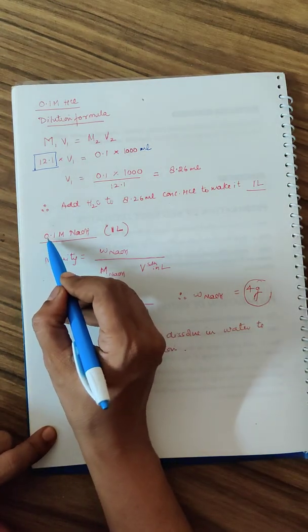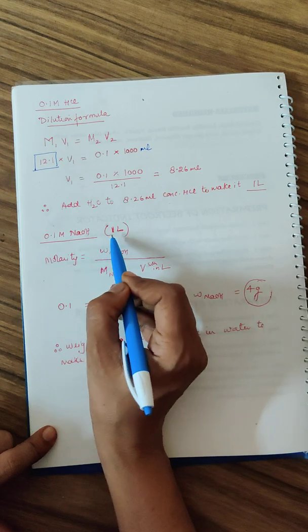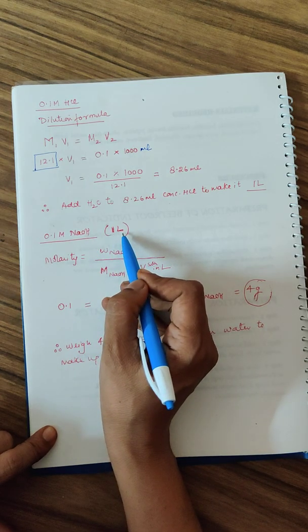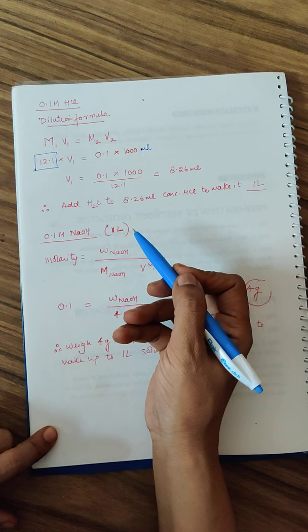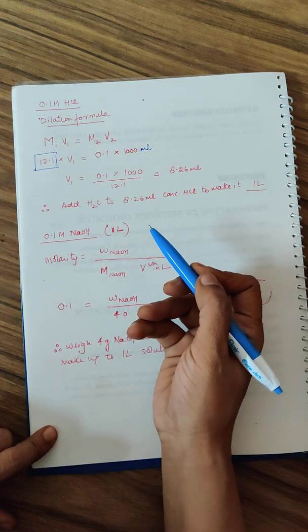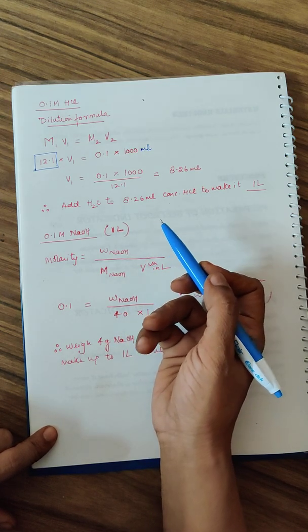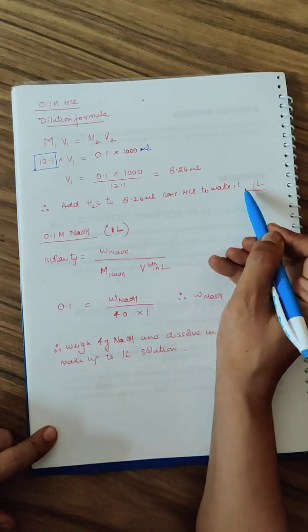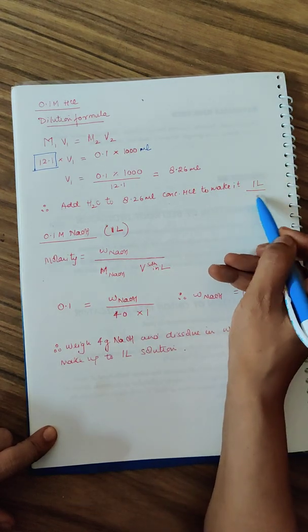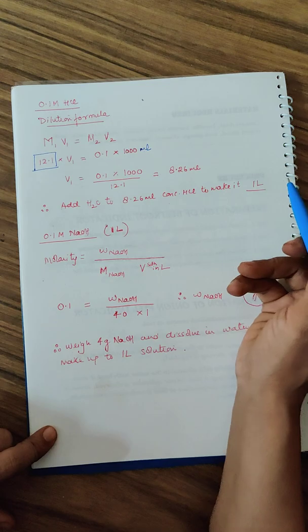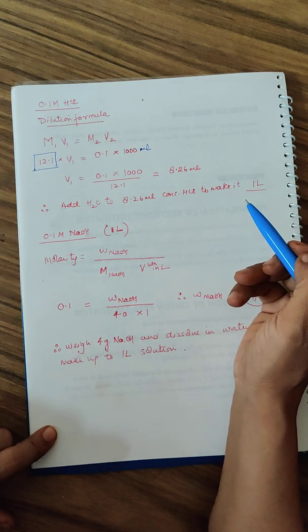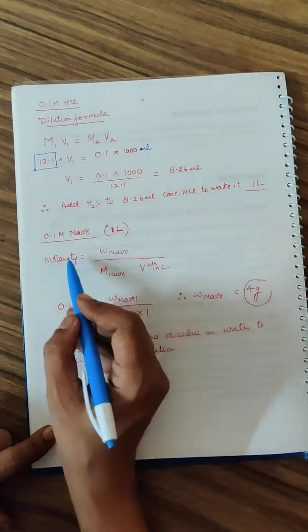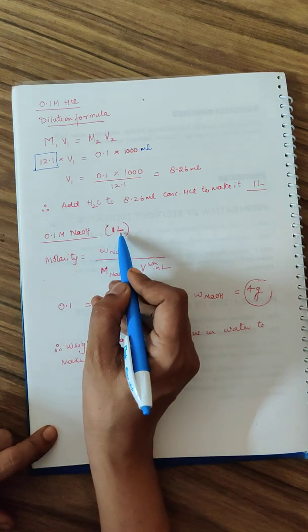Coming to the NaOH that you require, you again require 0.1 molar NaOH, 1 liter of it. There is no harm in preparing slightly excess because you will not keep preparing repeatedly. You can carry your coke bottles and keep these solutions in them in the lab for you to use whenever you do the project work.